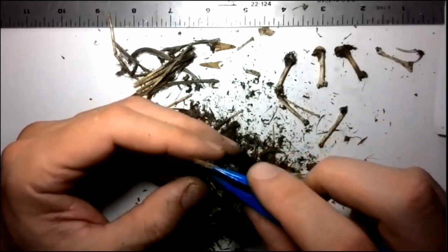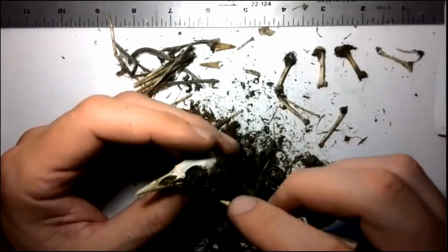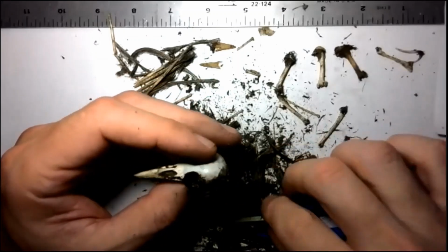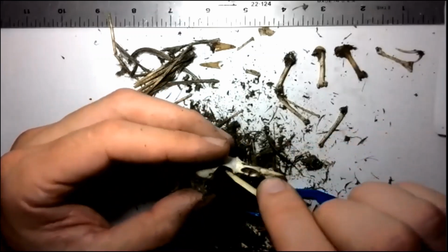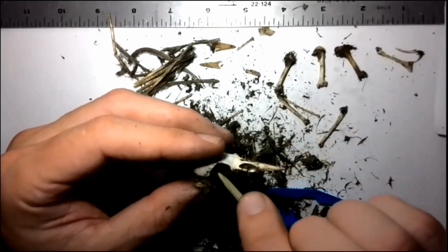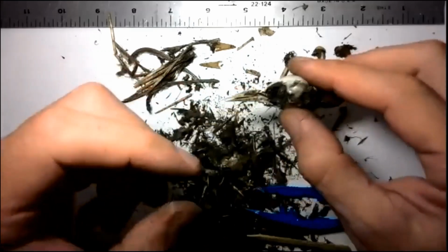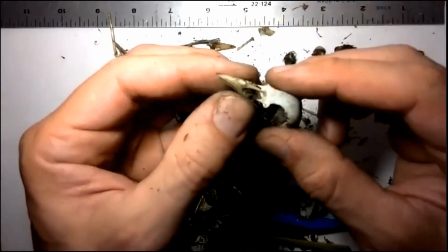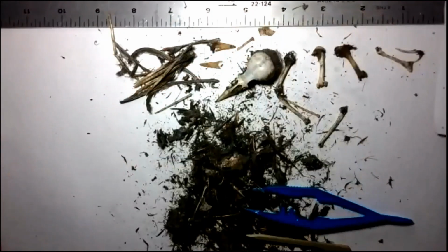Wow. All right. Doing good. Well, there was an interesting finding just right off the bat. No rodent in the menu for this owl. I have to continue cleaning it up later. At least that will give you an idea. And you can see the eye sockets here, parts of the beak. A pretty amazing jaw. And again, as I said, this is the lower jaw, so the entire beak is there, this robin. But anyway, that was a good pellet. That was a fun one.